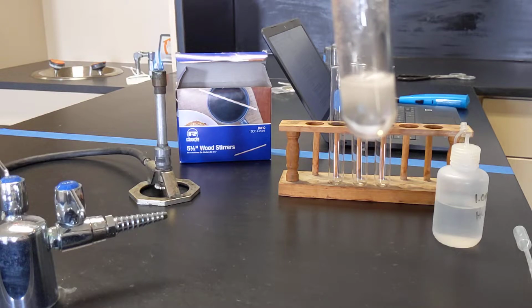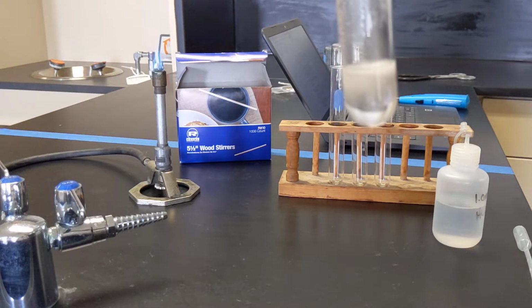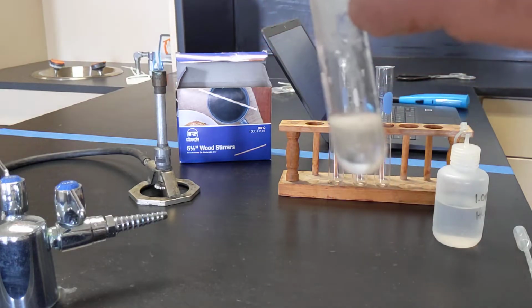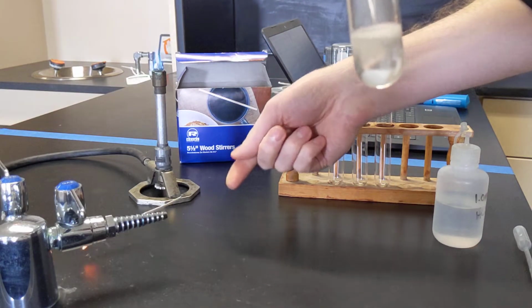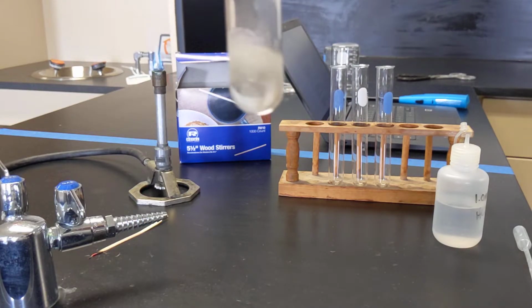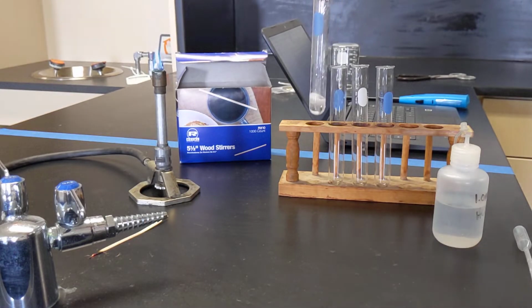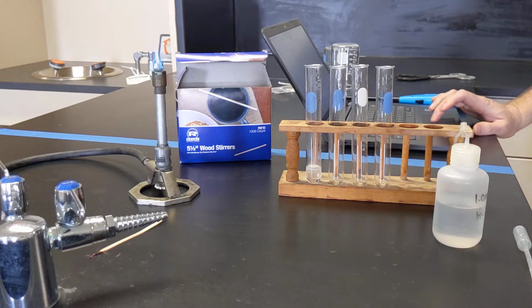Still bubbling. And then put this out, see what happens. I think you saw and heard that one, so that was definitely an ignition. There is some gas that was lit on fire, so it is most likely hydrogen gas. Okay, that is reaction 2.